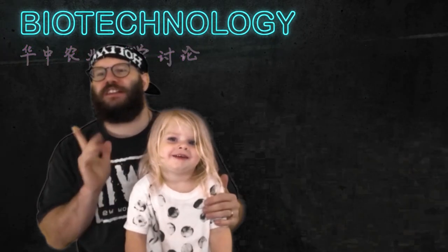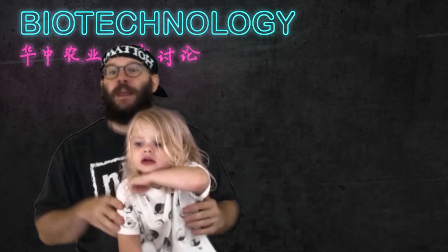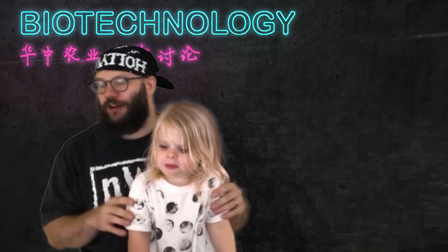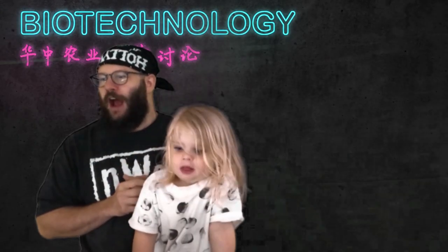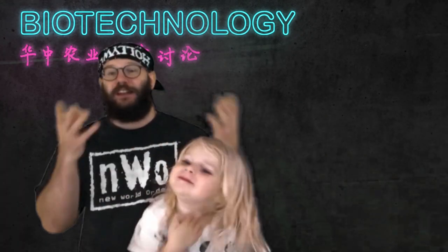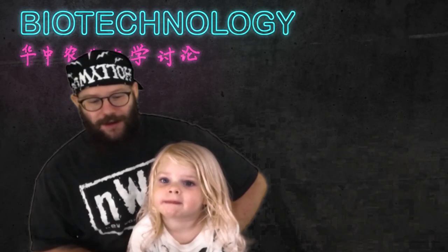So, I think it's helpful if we start off this lecture with a very, very basic introduction about how to cook solutions, working in the wet lab, how to make things that are going to be useful for your experiments. It's something that's going to be very useful for you in the lab on your first day when you first start doing experiments in the wet lab.